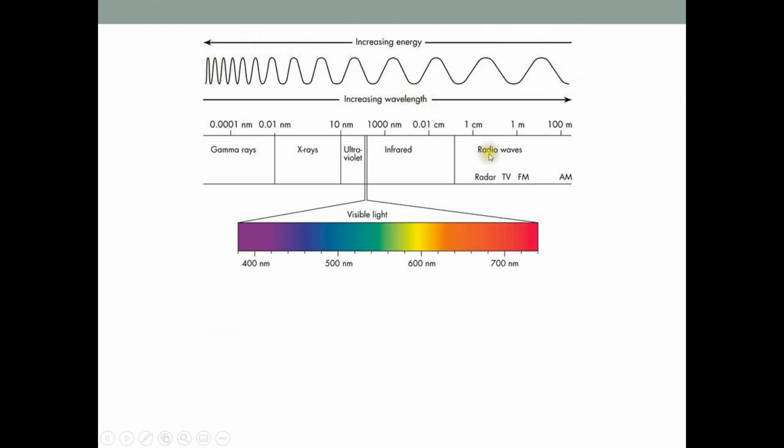So if we look at the spectrum here, it's labeled with the different types of electromagnetic radiation. Long wavelengths are often referred to as radio wavelengths: AM, FM, TV, cell phone, microwaves. And then you get into the infrared, the ultraviolet, X-rays, and gamma rays. And I think with just a thought experiment here, you can see the difference in energy.